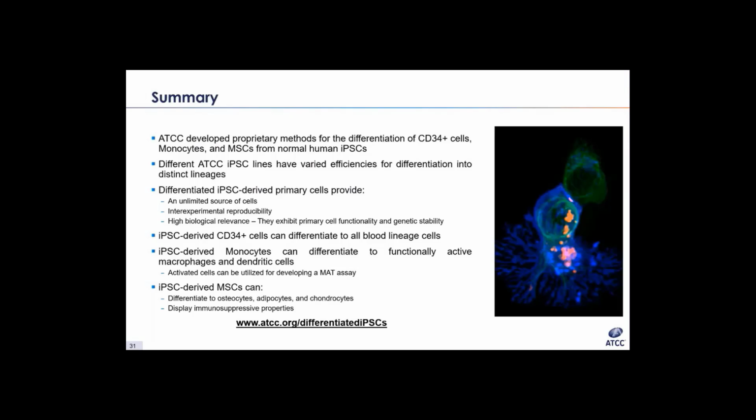The differentiation of the iPSCs to CD34 positive cells is not completely homogeneous since at least 20% does not express the CD45 molecule. Why is this? That's it. Someone who's paying attention. It's a great question. So the emergence of CD45 expression actually correlates with commitment to lymphomyeloid cell lineage. Now, once you have a higher proportion of cells expressing this marker, the cells just overall have gone too far along the differentiation lymphoid lineage, and they're pretty much committed then.